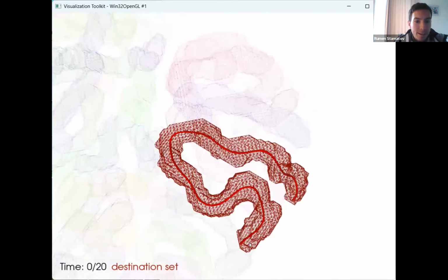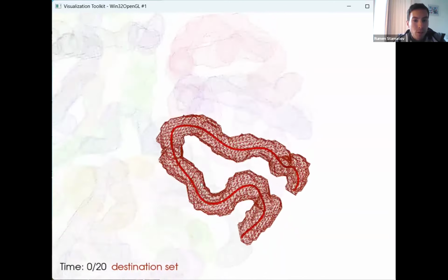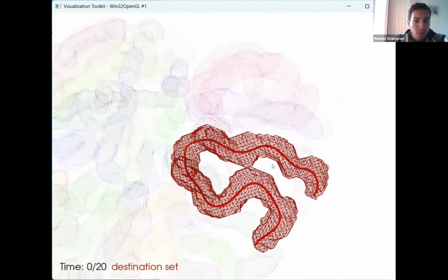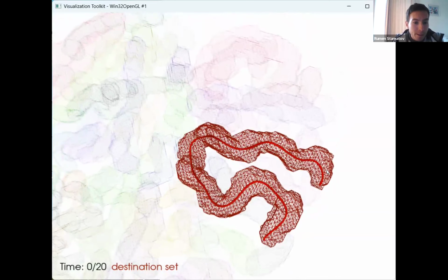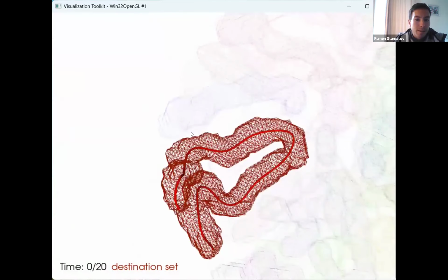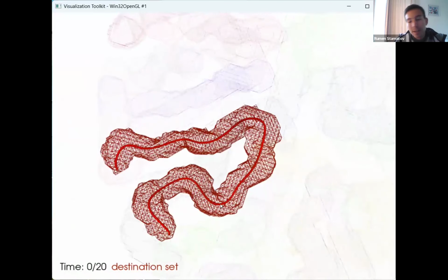And what's nice about it is that you can see that this curve actually goes through the center of the structure, which is not always the case in many of the existing software programs. Especially those of you who have done some skeletonization before, you know how difficult this problem is mathematically. In many cases, the endpoints of the structure are usually missed. So yeah, this is how we can do it in this tool too. We can measure this length and record it to a file and so on.